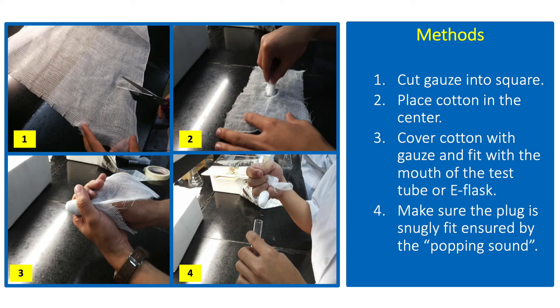To make a cotton plug, cut the gauze into squares depending on the diameter of the tube or flask, then place a lump of cotton at the center. Cover the cotton completely with the gauze and fit with the mouth of the tube or flask.